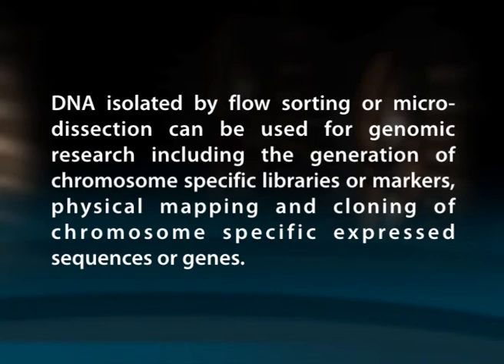DNA isolated by flow sorting or micro-dissection can be used for genomic research, including the generation of chromosome-specific libraries or markers, physical mapping, and cloning of chromosome-specific expressed sequences or genes.